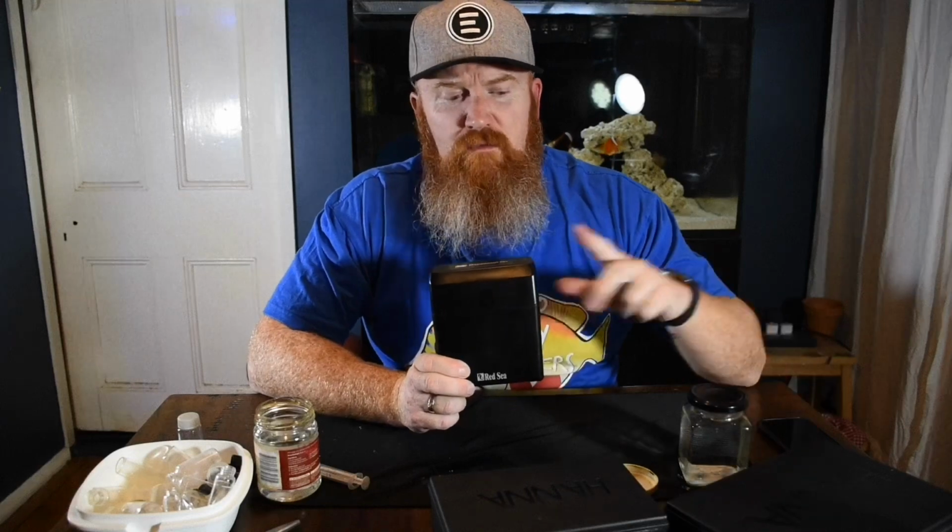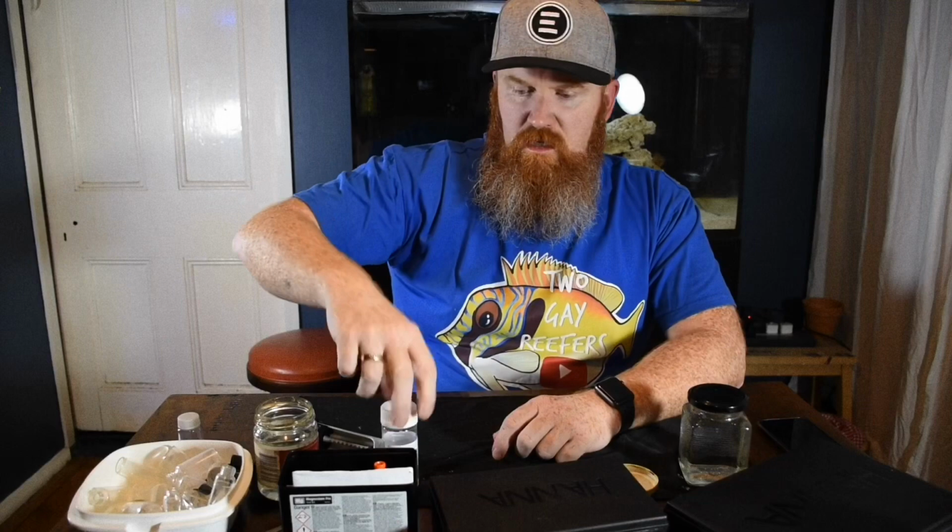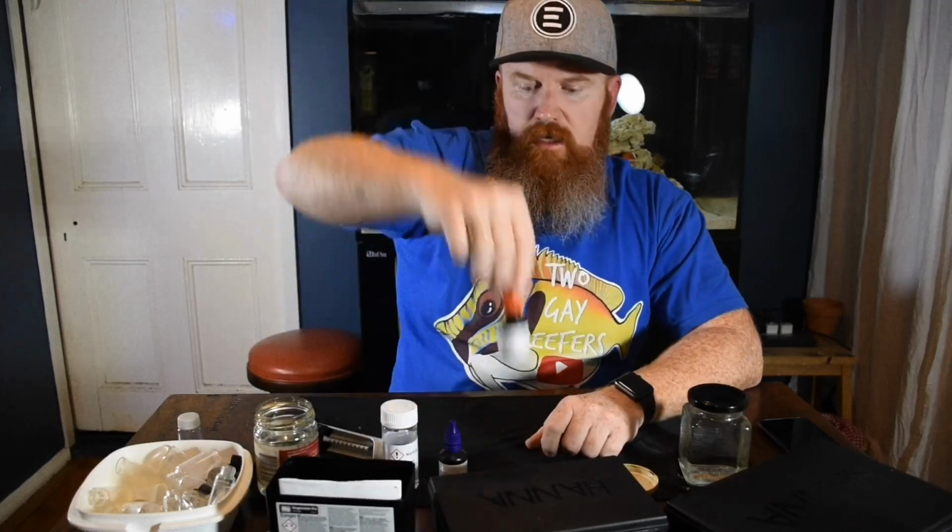This one, other than the calcium Hanna checker, these two are the most annoying tests I have to do. They're just really complicated and time consuming and fiddly. But I think this one's probably the worst. So, once again, get everything out again. So you got your syringe, reagent C, reagent B, reagent A, 2 mil syringe, and your card.